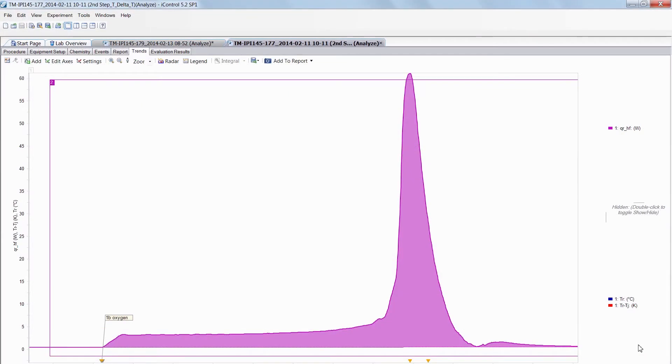Now I'd like to show you the second step that's a lot trickier for large-scale implementation, and I'm talking about the oxygen oxidation of the resulting anion into benzene alcohol. At this point oxygen was introduced to the vessel and you can see the heat going up from zero to about 3-4 W for about 10-15 minutes. If you were in the lab at that time you may conclude that the reaction is pretty much uneventful and well behaved, and if you had stepped out of the lab you may miss that huge temperature and sudden increase of energy.